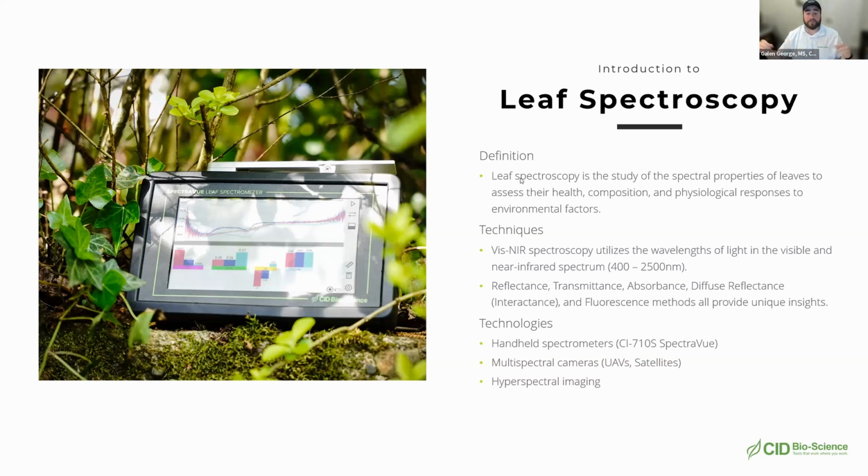If you're doing a comparison study, let's say, over the course of 2 months, and you only calibrate the first time you use it, and then you don't calibrate anytime after that, if you looked at your spectra on the last day versus the first day from your control plants, you will see significant differences in where they are in height, basically bias-wise, in that spectra graph. And that alone will cause artificial inflation or under prediction of those vegetation indices.